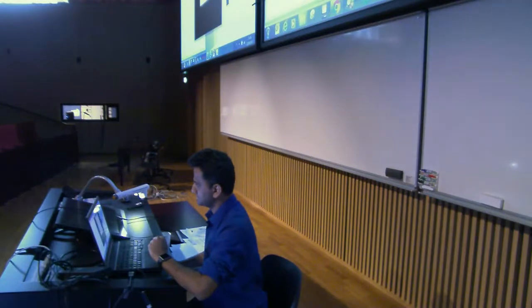Of course, it's not as fast as Imaris, but you can actually do many things. See here now? Not bad, right? And this is the time point, time lapse. So it's not that interactive, okay?